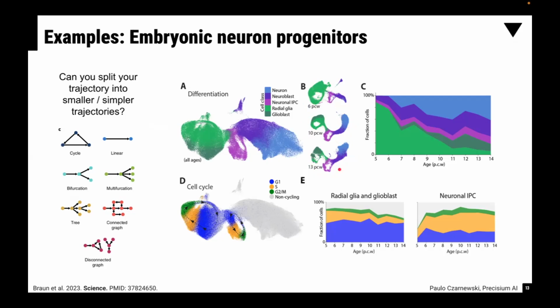But later, when you do differential gene expression, you're not accounting for the biological time. You can always plot versus the biological time, but you will see more into what is the state of each cell. Even though this one doesn't have mature neurons, when you do the trajectory, you know that these ones are more mature. You can see this gradient between the neuroblasts and the mature neurons in the end. I see. Okay, thanks a lot.